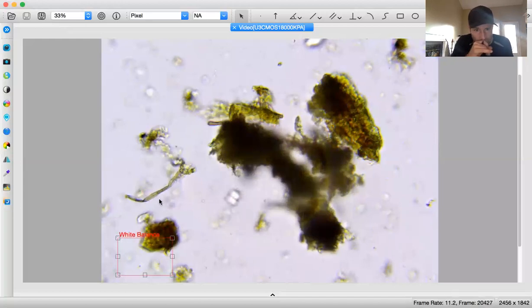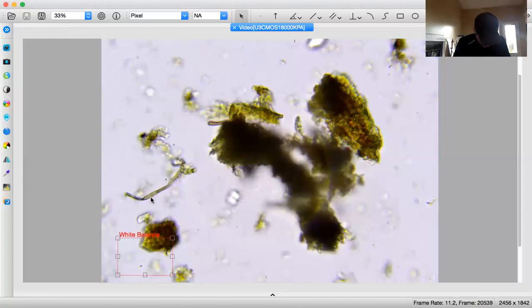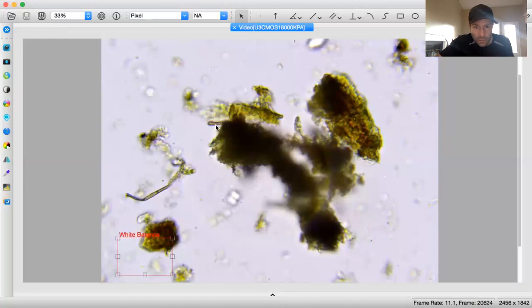I'm going to go, this looks healthier, I think, and this is uniform with this. So I'm going to go with 2 micrometers. And that is a fungi, and we're going with a tan, I want to say. Now I do see some that could possibly be filaments, but that's a rounded end and it's bulbous. So that is indicative of something we should measure according to the rules that we follow.